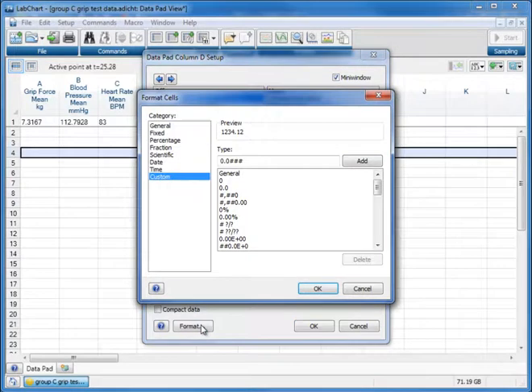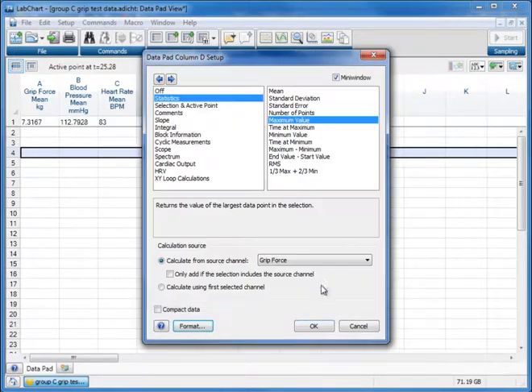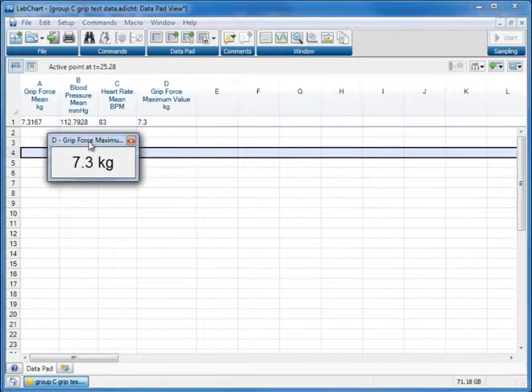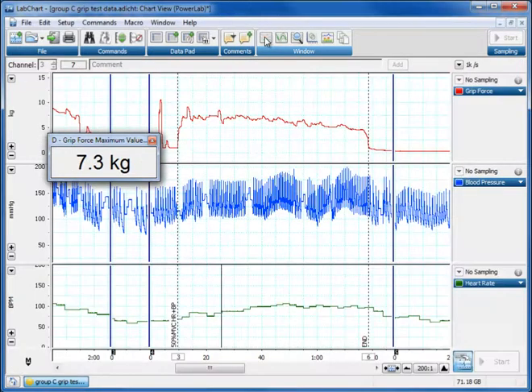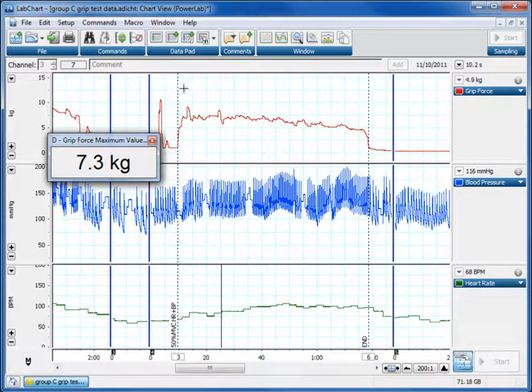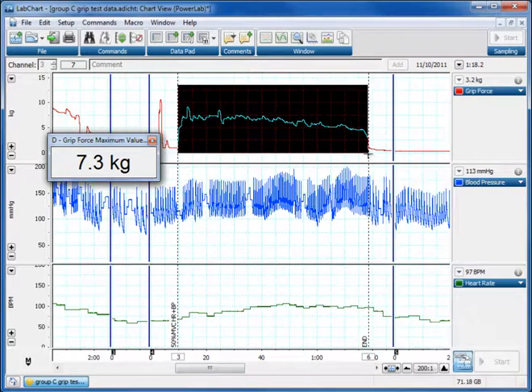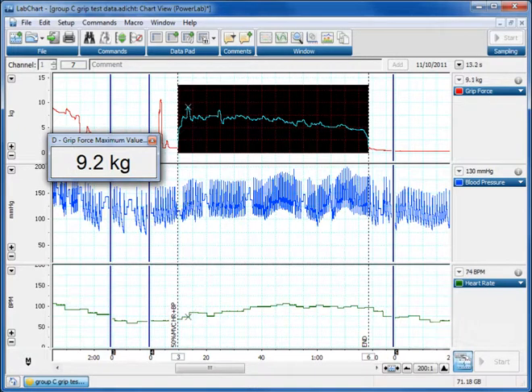Format our data so it's perhaps one decimal point. There's no point in having four decimal points. Press OK and now we've got a little maximum window here. So it says grip force maximum value. Go back to our chart. Select a period here and it's telling us the maximum value is 9.2 kilograms and I'm reckoning that corresponds to this peak here.